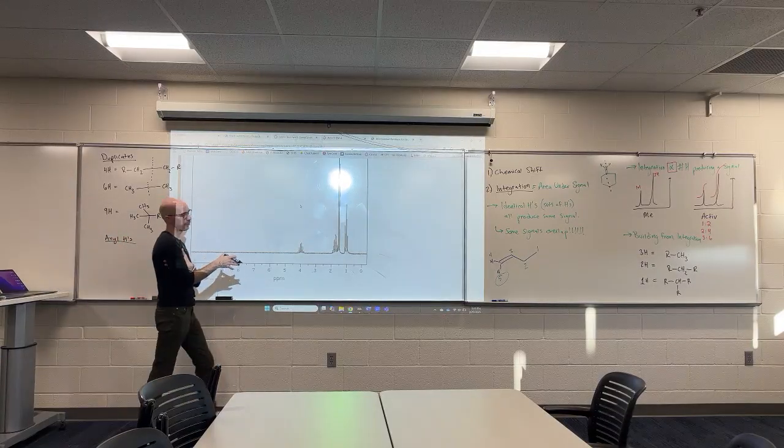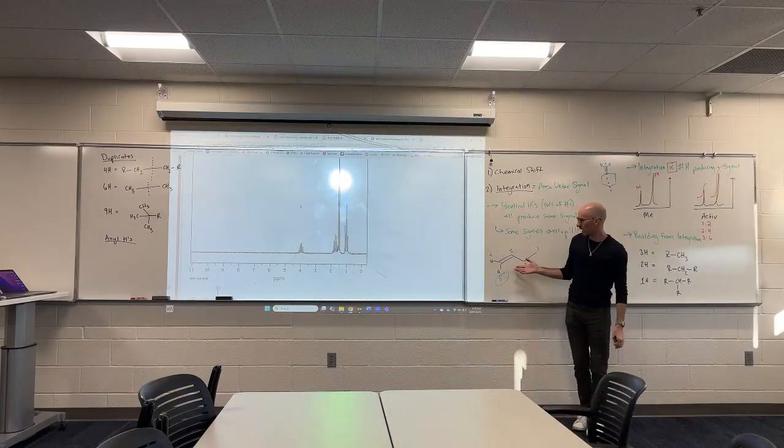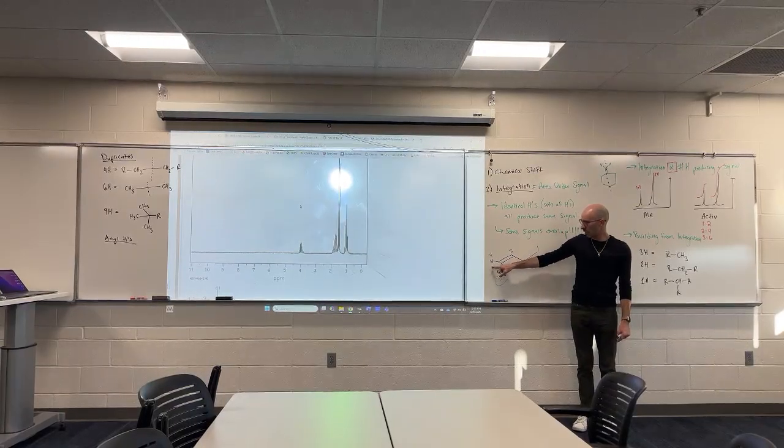I already told you that vinyl or vinylic hydrogens are kind of weird in the ways that they look. They can be attached to the same carbon and still give different signals.